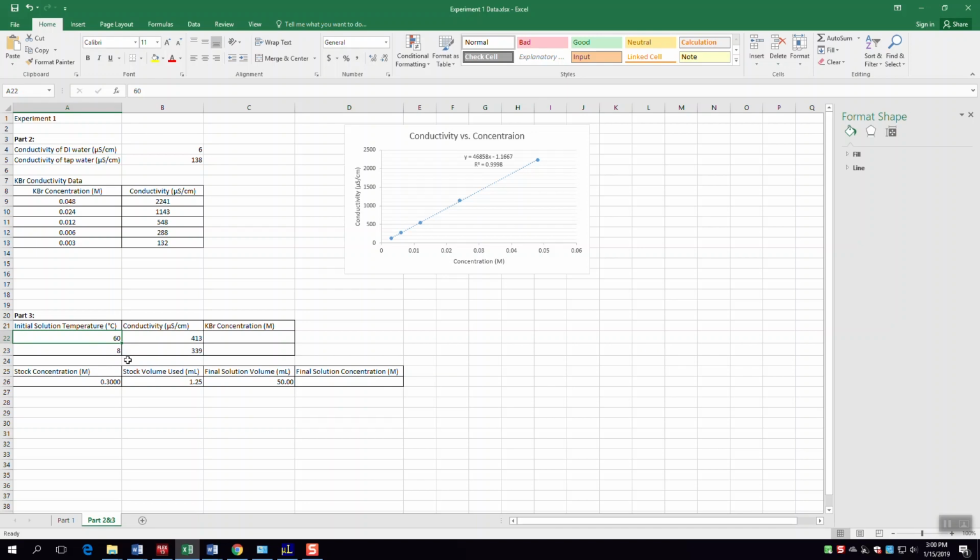It's really important that you don't heat the water above 60 degrees. In fact, even if you heat the water a little bit less than 60 degrees, that's fine. We just don't want you to hurt yourself. If you're trying to pour in 80 degree water, that could cause burns. And 100 degree water, boiling water, could certainly cause burns. 60 degrees is hot, but it for us was manageable, and that's going to vary a little bit from person to person. So don't heat it up beyond a manageable temperature.